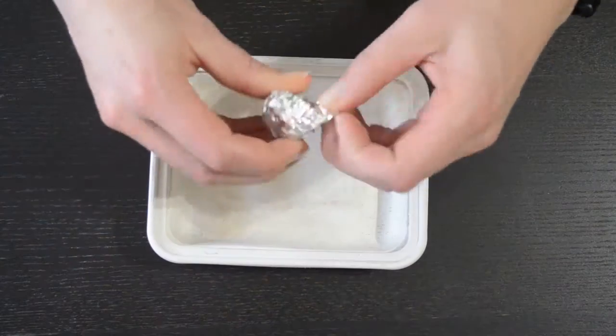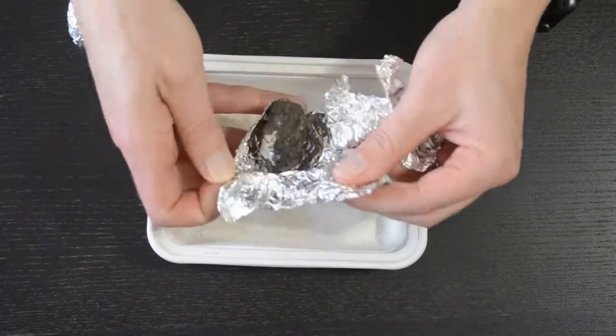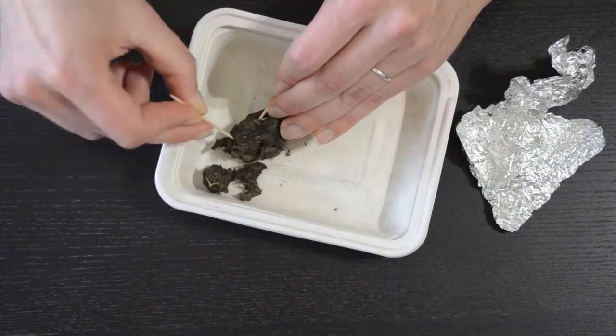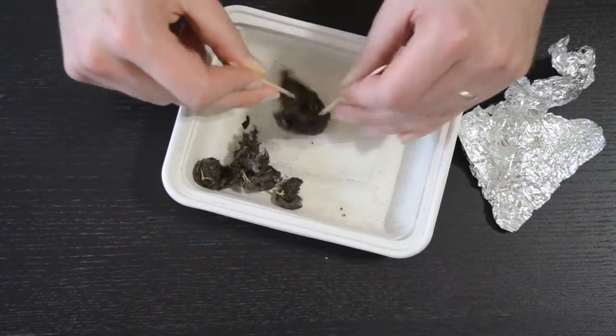If you purchase a pellet from one of the many places that sell them online, like we did for this pellet, it will arrive wrapped in foil, sterilized, and will be pretty hard. The outside of the pellet can tell us a little bit about where the animal got its food. Does it have pine needles, small rocks, grains?